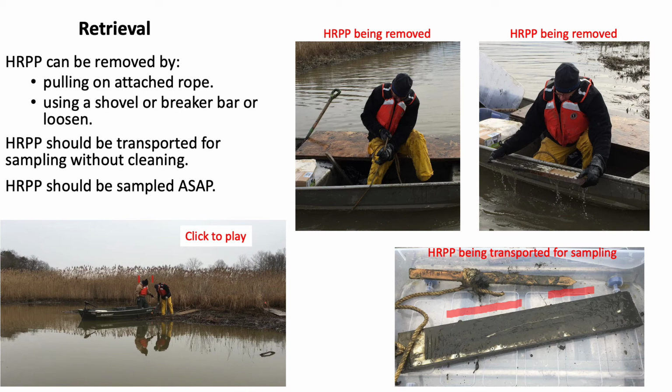It's a little bit more difficult. Usually some fuel station, a parking lot, any place that a table can be set up nearby is deployed, which allows the sampler to be sampled a little bit more easily. If you wish, the picture in the lower left can be clicked on in order to be able to show a short video of the samplers being removed.